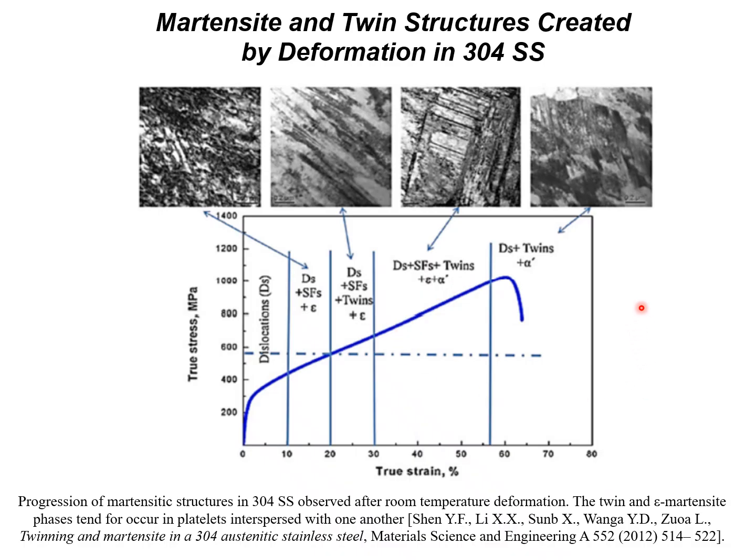partly to a lot of confusion in the literature where many people who report on microstructures who are not totally fully understanding what they're saying often just refer to martensite, and really what they mean is there are three types.